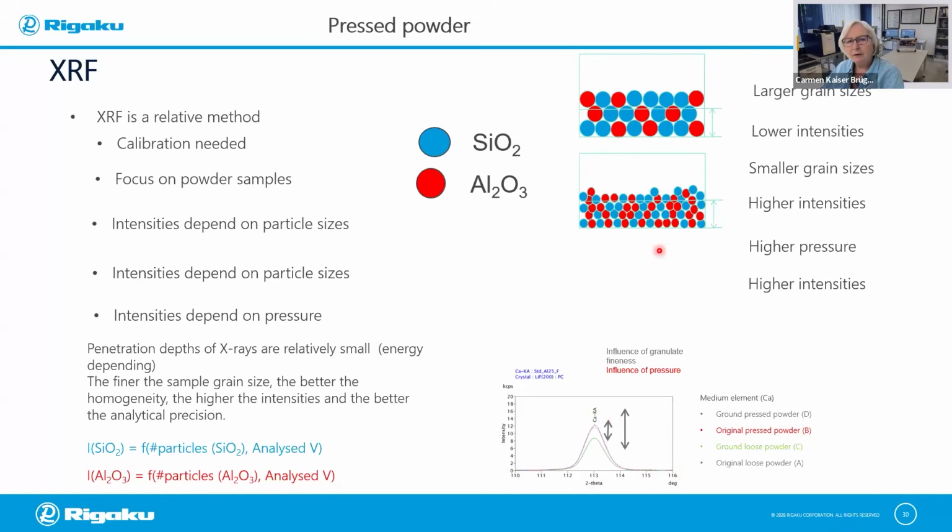And also the analytical surface should be absolutely perfectly straight and smooth without any imperfections, because very often the lighter elements might be influenced by this. So the fluorescent X-ray that I was talking about will be influenced. So it's really important that preparation is correct.